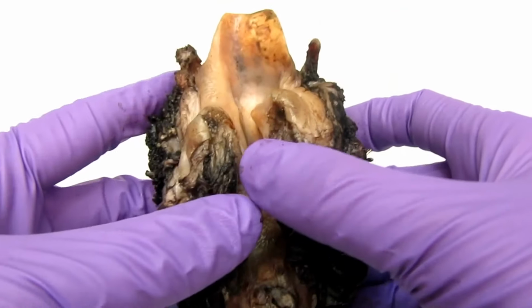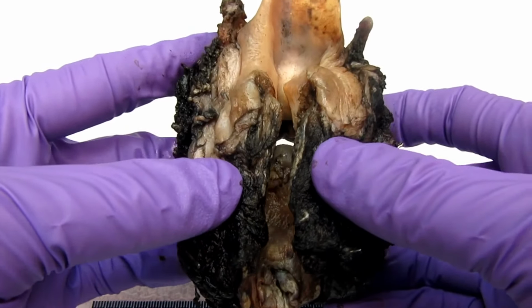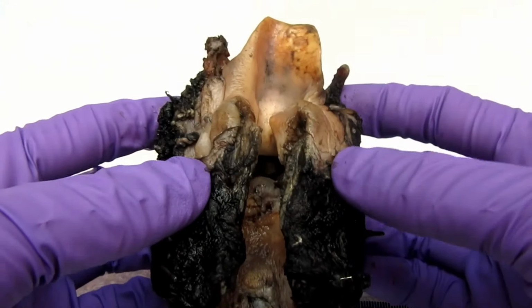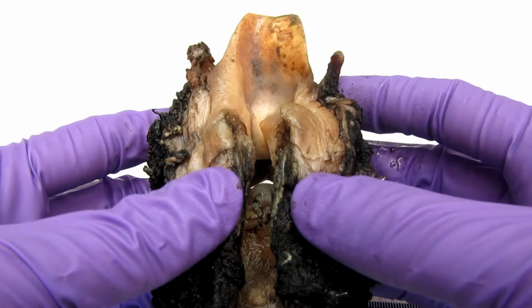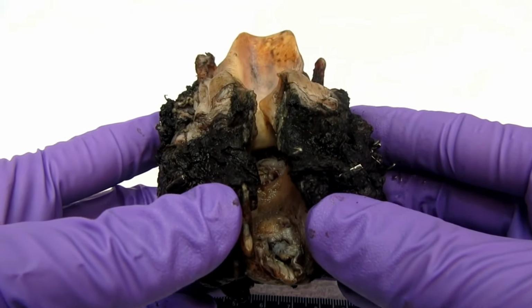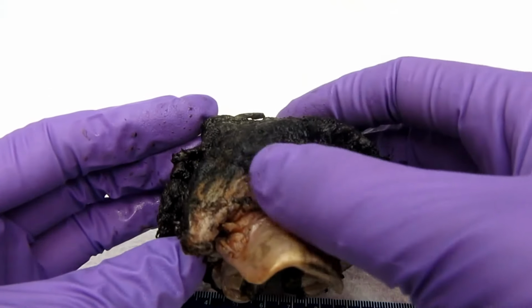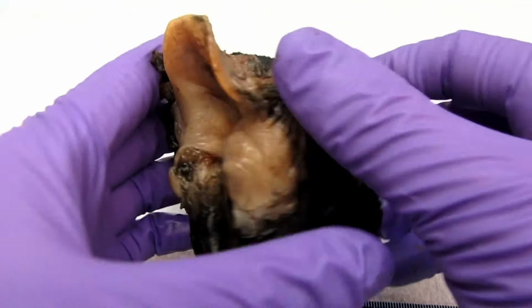So if the necrotic lesion is a tumor, we're definitely going to have to think about margins. So for this specimen, we'll have to consider our aryepiglottic fold margins, our piriform sinus margins, our posterior cricoid mucosal margin, inferior tracheal margin, left and right soft tissue margins, pre-epiglottic space margin, which is this fat-filled area in front of the epiglottis, and our skin margins.